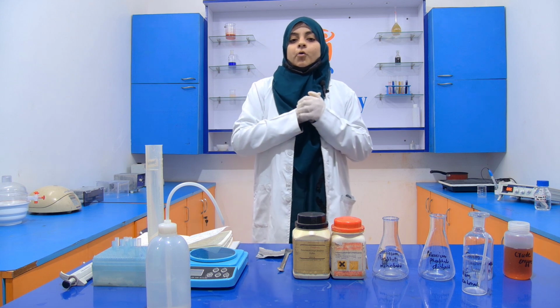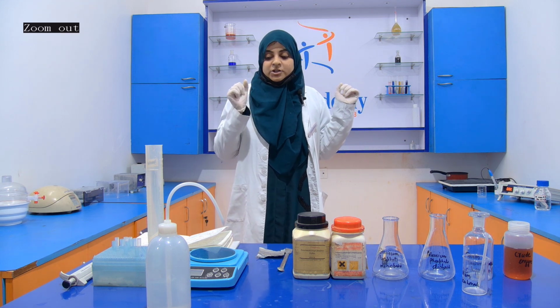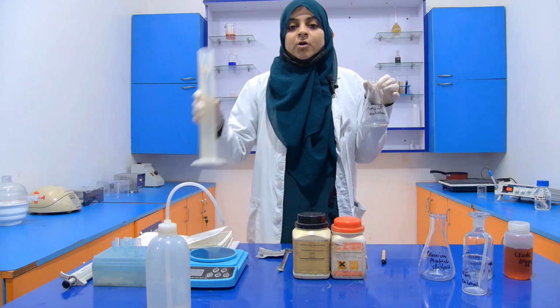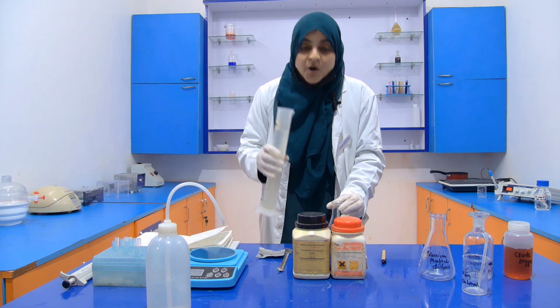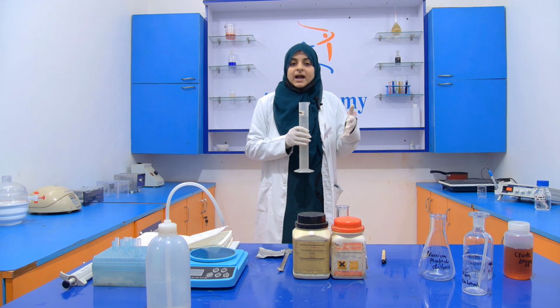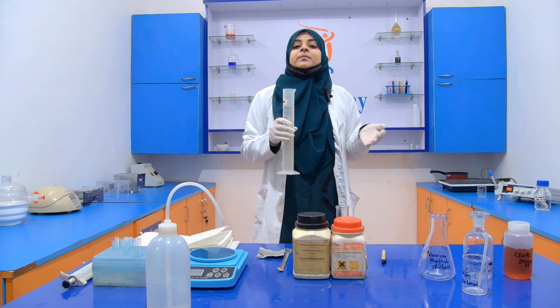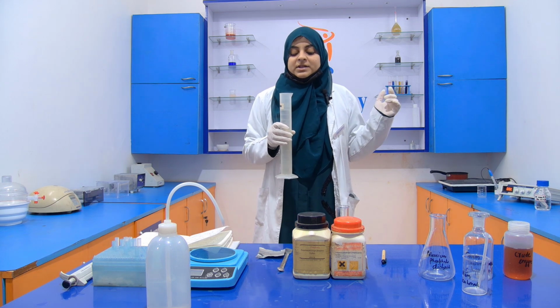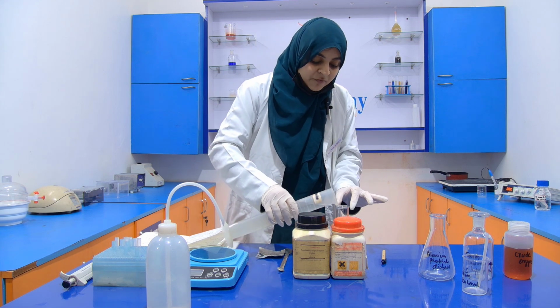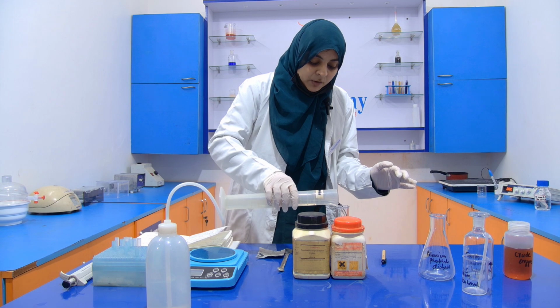For this, we require a monobasic potassium phosphate and a dibasic potassium phosphate. So, first of all, we are going to prepare the monobasic potassium phosphate. For this, we require 34.02 gram of monobasic potassium phosphate, and it will be dissolved into 250 ml of distilled water. Now what we are going to do, first of all, we take half of the distilled water, like 110 ml of distilled water.